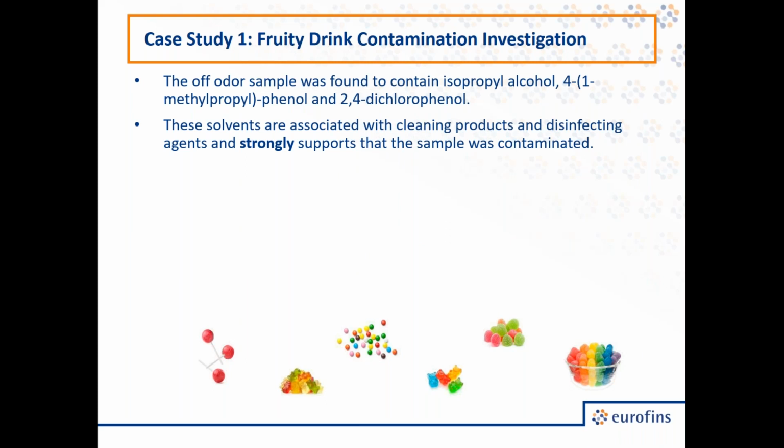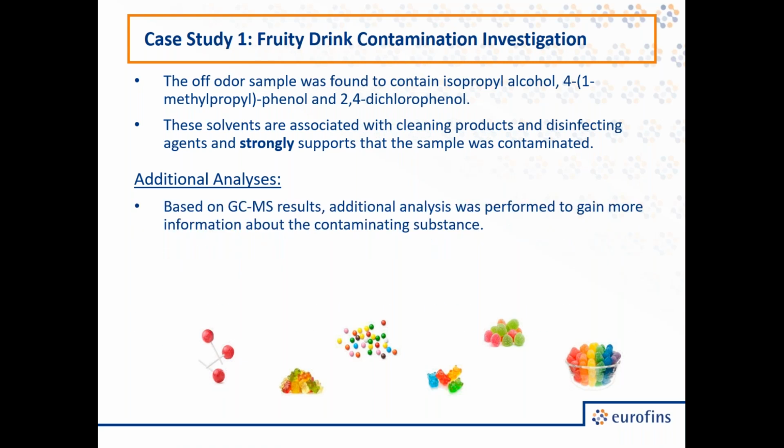So these compounds are all solvents that are associated with cleaning products and disinfecting agents, and this strongly supports that the sample was contaminated because we would not expect these compounds to be present naturally in this type of product, and because obviously we did not see them in our control. So in this case, we pursued additional analysis as well.